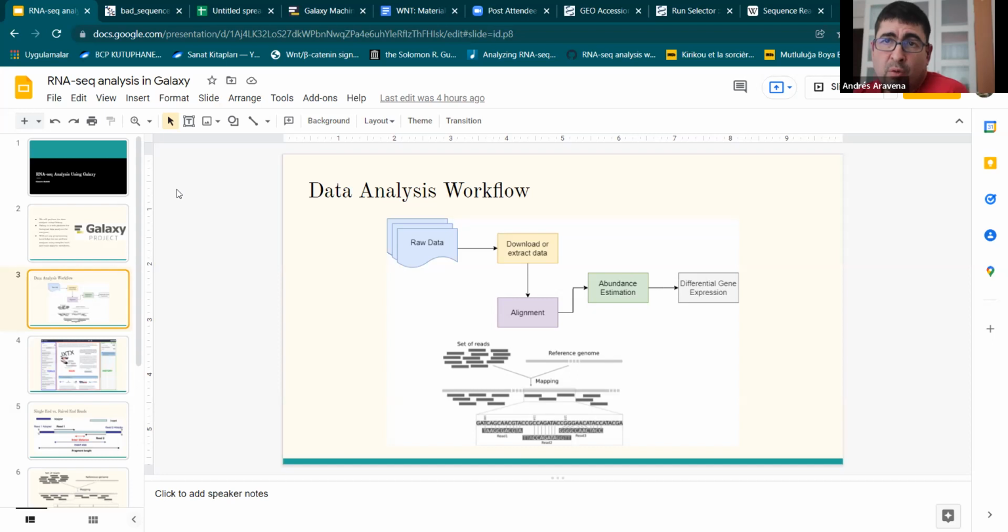I think that is the question, no? But there may be another interesting point: if we are counting with introns, then sometimes some reads may not match. Let's say the read contains the intron, so it may not be aligned correctly. I don't know. It would be interesting to know.